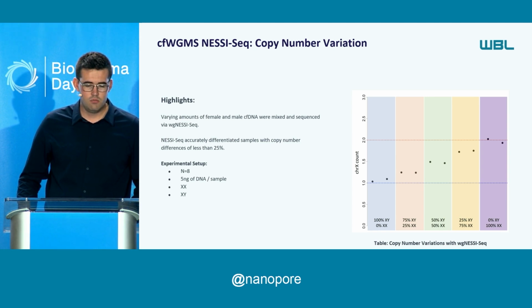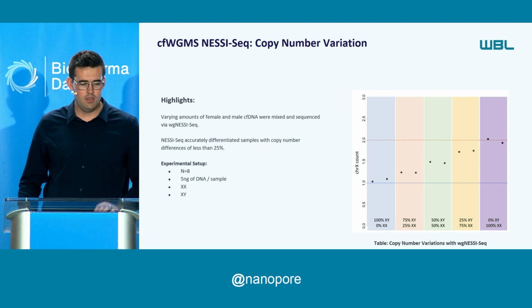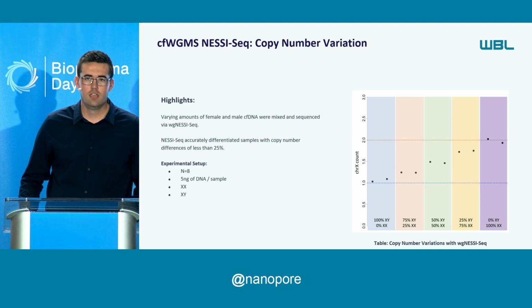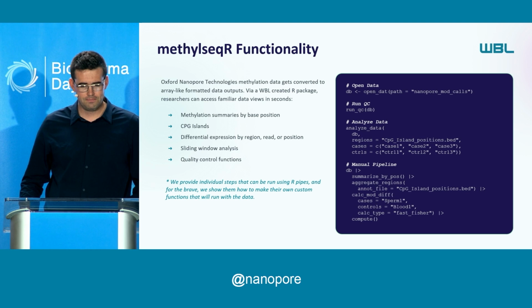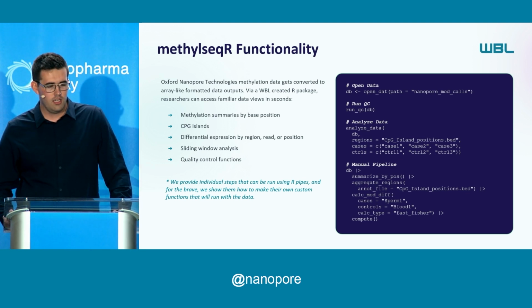those chromosomes. There's a lot of work to be done with copy number variation. Our expertise is in methylation, but we have done some work to show that you can utilize both the genetic and epigenetic information together. In terms of making it useful for a lot of people, our clients, we want to enable them to do biomarker discovery rather than handling it all ourselves.